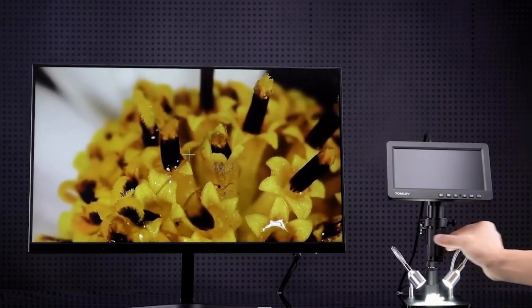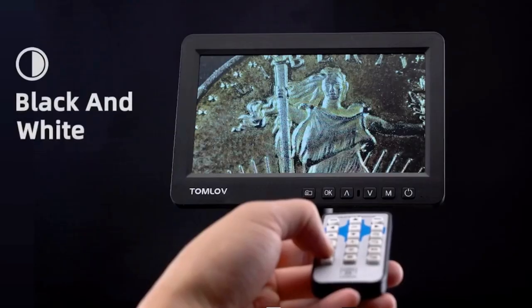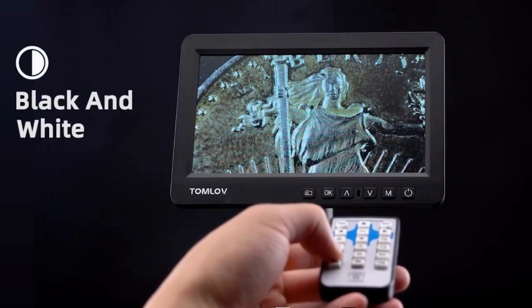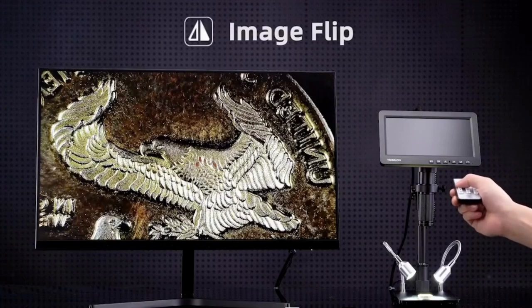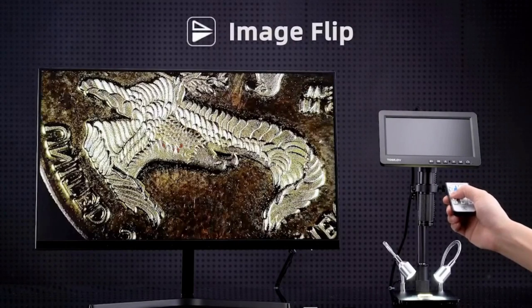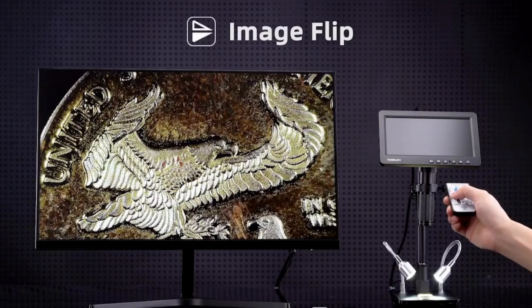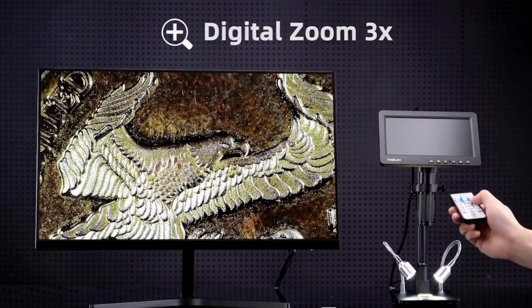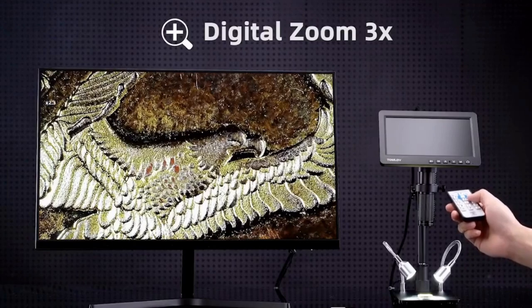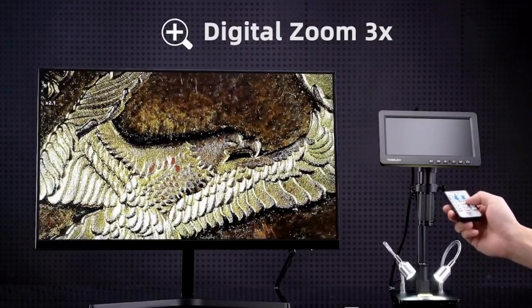Don't want to be confined to a tiny screen? No problem. This microscope easily hooks up to your laptop's larger display without compromising image quality. Setting it up is a walk in the park. No apps or software downloads required. The default Windows Camera app works seamlessly with this microscope. Just note, it's compatible with Windows systems only.